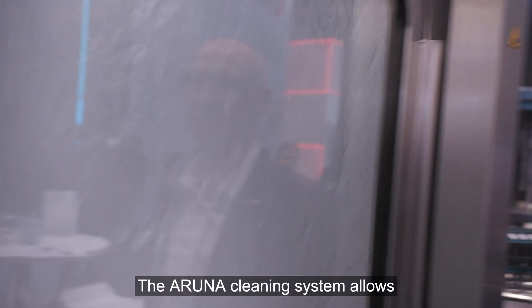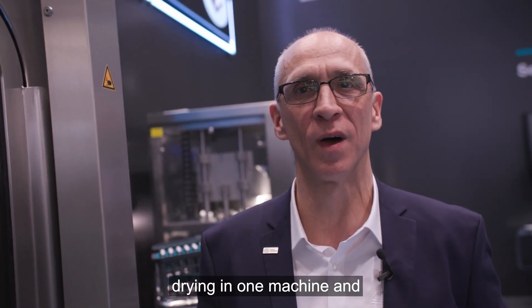The ARUNA cleaning system allows cleaning, preservation and drying in one machine and, of course, GMP compliant.